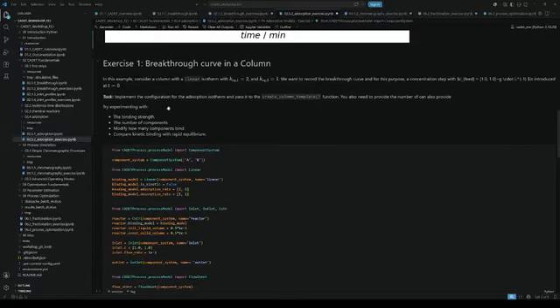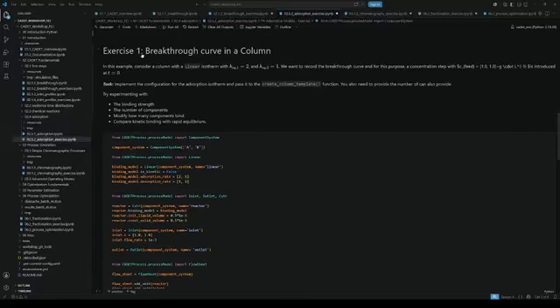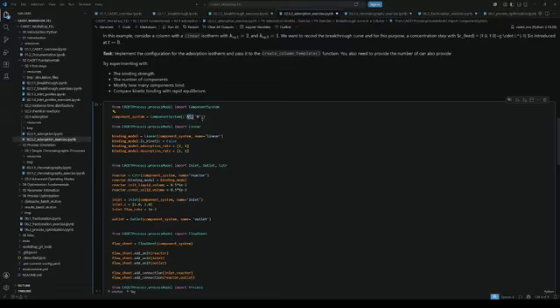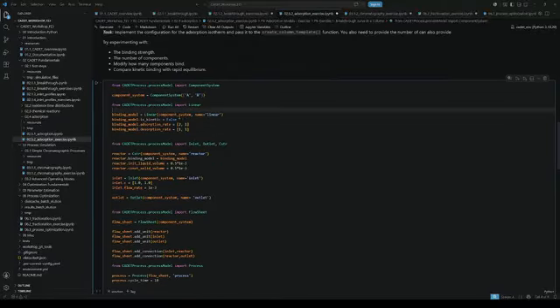Okay, and now we want to see how this adsorption model works for breakthrough in an actual column. So we have set up here a column system. Now we have two components, components A and B. We don't have a kinetic system anymore, so it's instant equilibrium. And now we have to define adsorption, desorption rates for two components, for component A and for component B. And right here we're setting up that the adsorption rate for component A is twice the adsorption rate for component B.